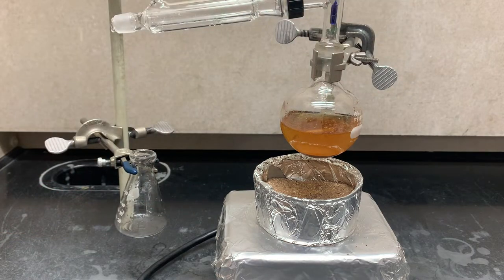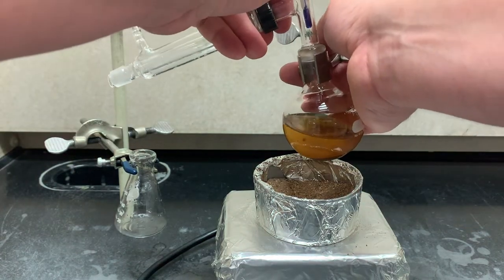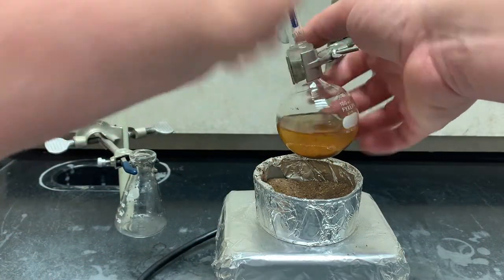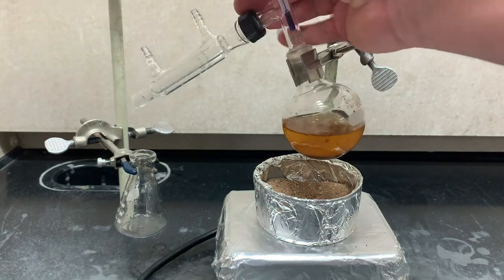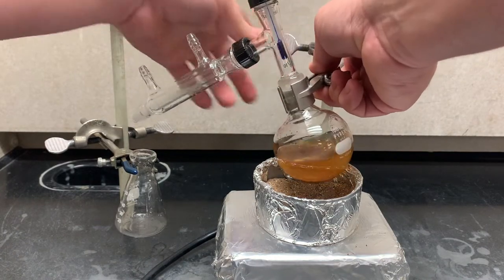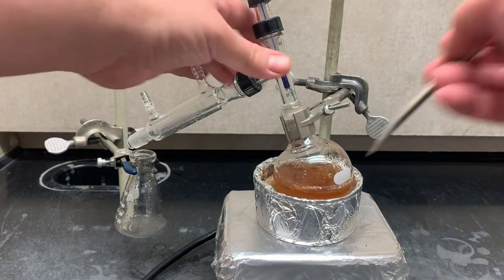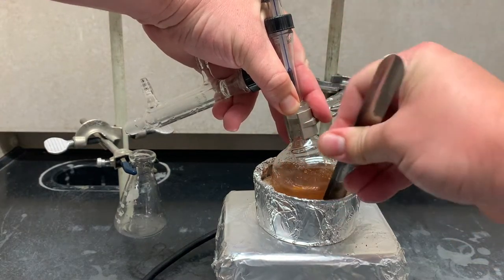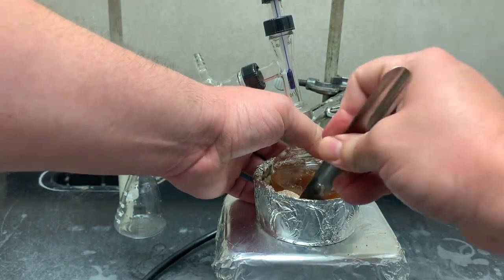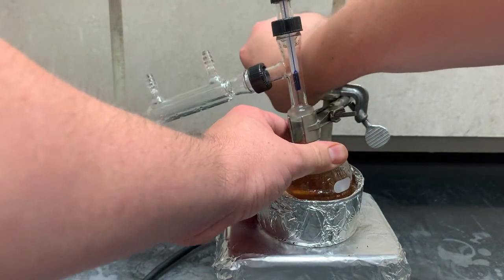Now, what I highly recommend is that you actually do this. So when you're setting this up, you want to do this at an angle that will actually force it to drip down and prevent it from collecting right there. So I'm actually going to create that angle, make sure everything's nice and tight. And now I can lower it into position and just kind of try and get that into the sand bath. Move the sand a bit from below it, that'll make it a little easier. Okay, that's into place.